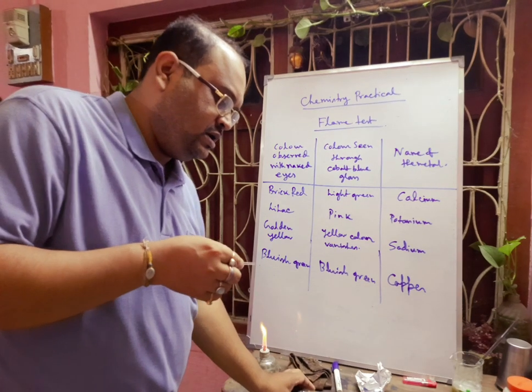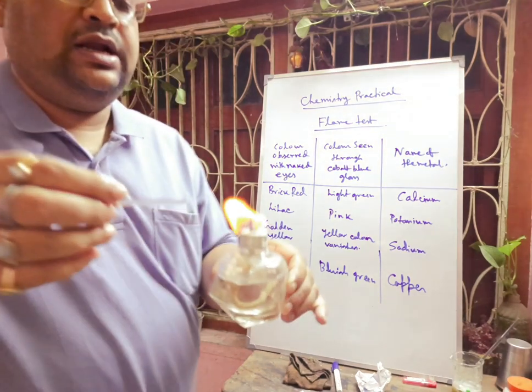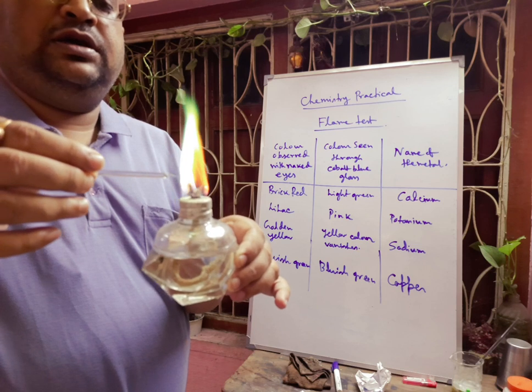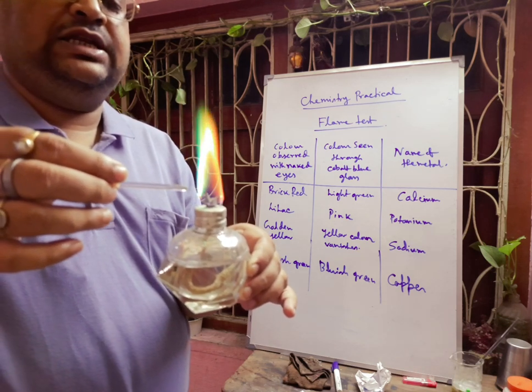We have taken a little bit of copper salt dissolved in HCl, and here you can see a bluish-green color coming.